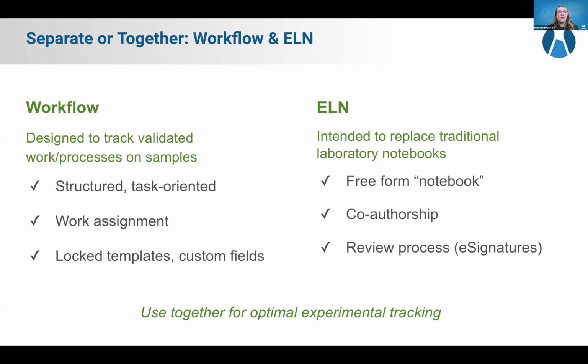And then finally, we also allow for locking templates and customizing fields on it, really helping with the overall data integrity and compliance piece. If you need to have a very strict workflow of things, the workflow tool is very useful for that.